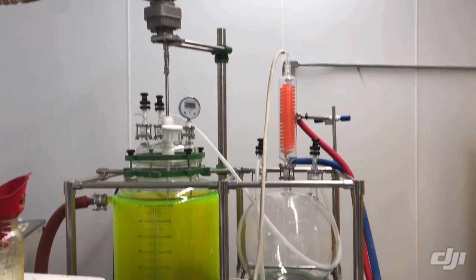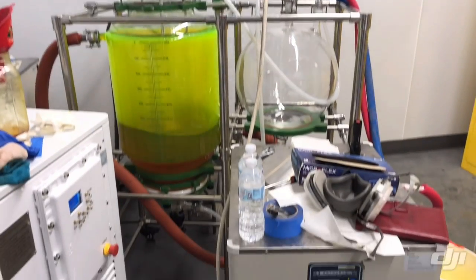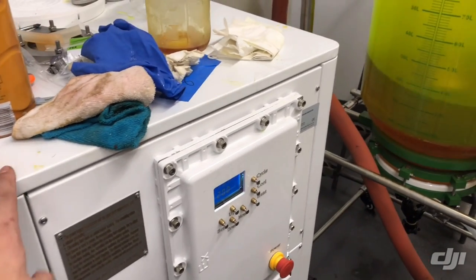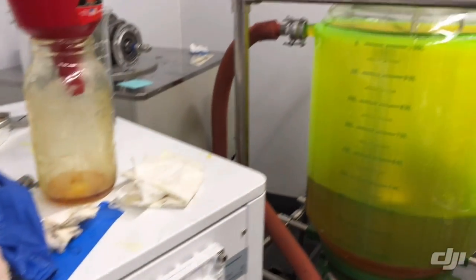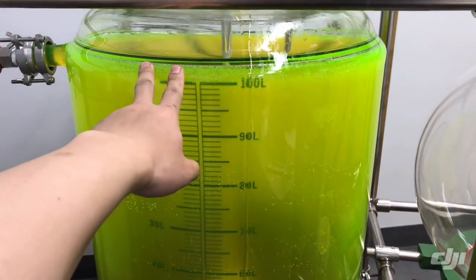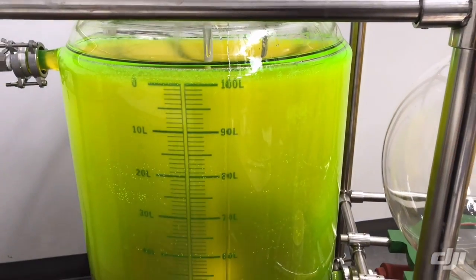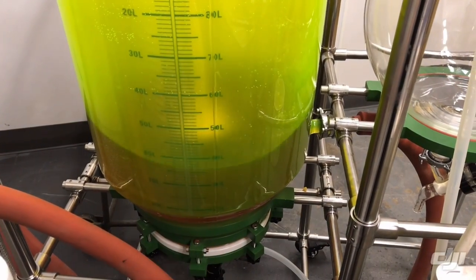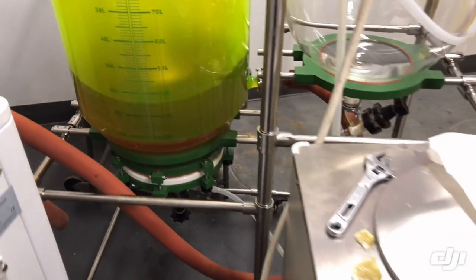This is what the equipment looks like once we hook up all the parts and tubing. We have two supporting units on the left — a temperature control unit that can go up to 100 degrees Celsius or down to negative 40 degrees Celsius. This controls the jacket of our reactor. We are currently running some CBD solution with pentane right now.